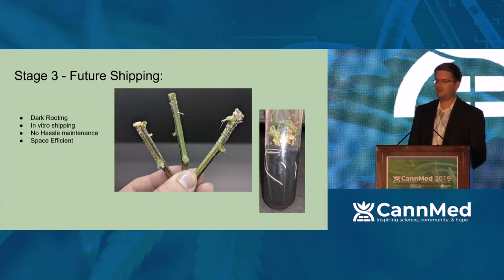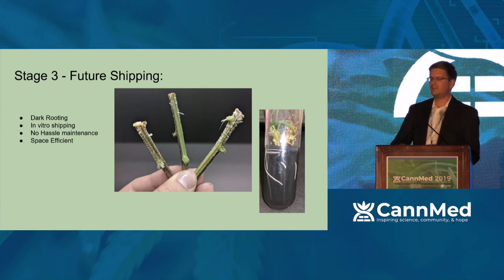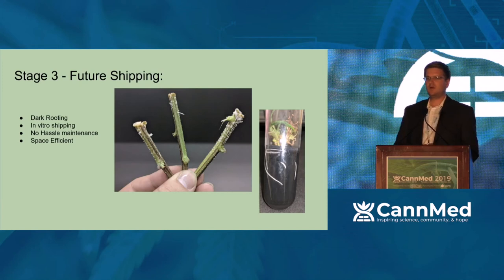And so I gave it a shot in tissue culture. Why not try it in vitro if it works ex vitro? And the results I got were varied. Every plant rooted, yes, but if you look at that picture, the top of the plant didn't always look completely healthy. And that could be due to a lot of different things. Chances are it wasn't developing some sort of hormone, and you need to develop a protocol for that particular cultivar that would fix that issue. In my case, I was just seeing binary A or B. Do they root or not? And turns out they do, which was huge for a lot of the future potential in this industry. Now, I also want to advertise, the roots are not going all straight down.